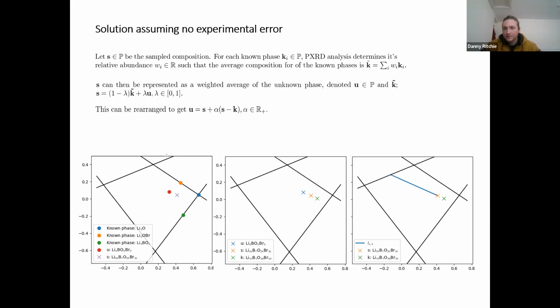Yes. So this seems a very powerful technique then, because we give to PXRD really something unknown, and it decomposes into, say, 3 knowns, as in this case, and 1 unknown. Yeah, I'm not an expert in PXRD, but is it really the case? Yeah, these sort of methods have been used for a long time. They will trial a new composition.